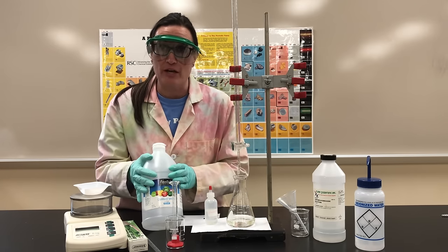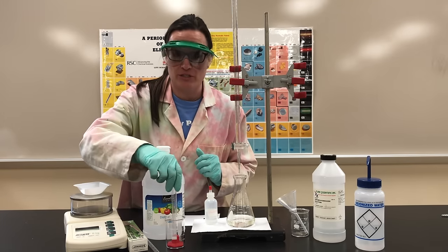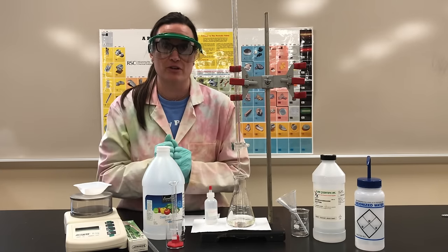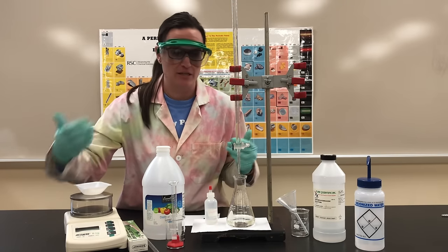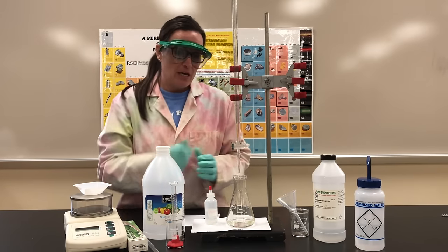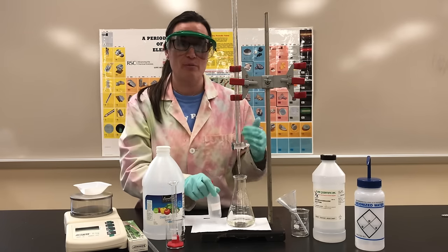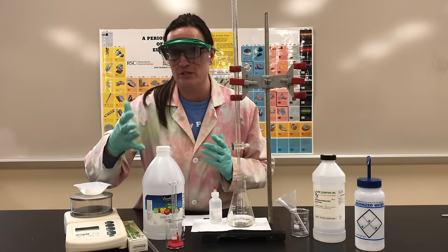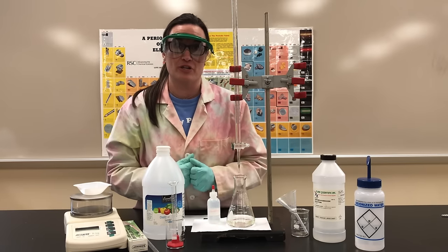I would measure the volume of that vinegar before I start and put it into the flask. I could use a graduated cylinder that's really accurate or a graduated pipette to measure the volume of my vinegar. Or you could have used a balance to measure a solid, maybe a solid acid. That would go in the Erlenmeyer flask, and typically you'll even add some water. The next thing is to add an indicator that's appropriate for your titration. For mine, I have a strong base, sodium hydroxide, with a weak acid, vinegar or acetic acid. Phenolphthalein is the appropriate indicator for this titration.